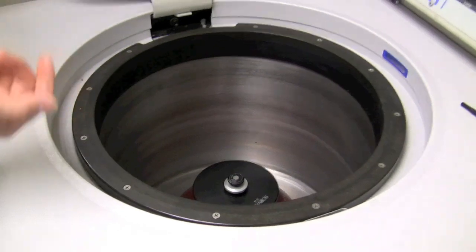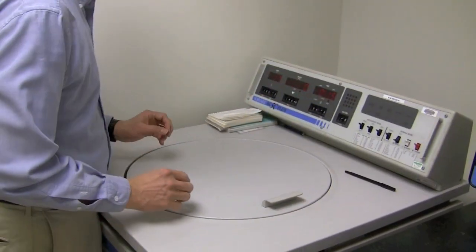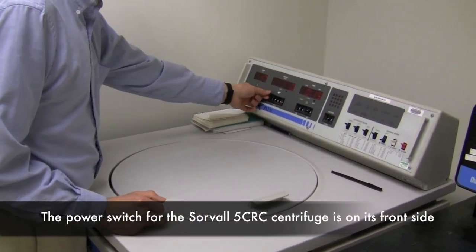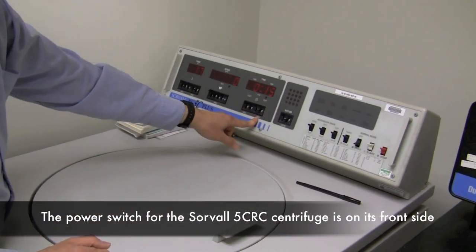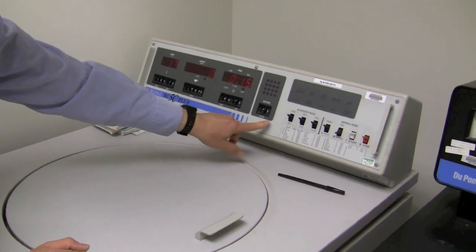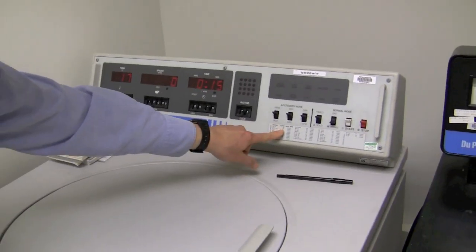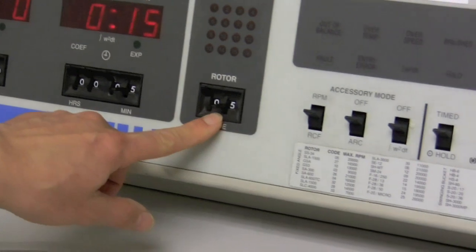All right, close the lid. And I would like to spin it at 13,000 RPM for five minutes, and this is the SS-34 rotor, which is rotor code five. So that's why it's zero five here.